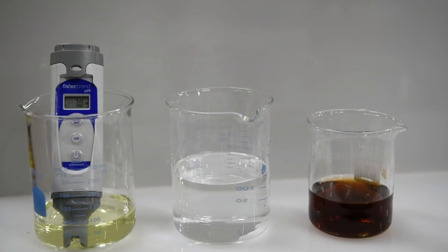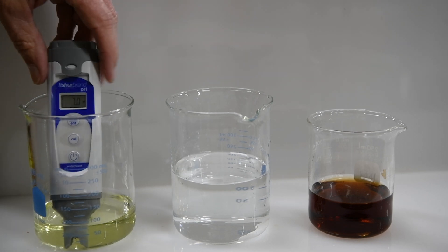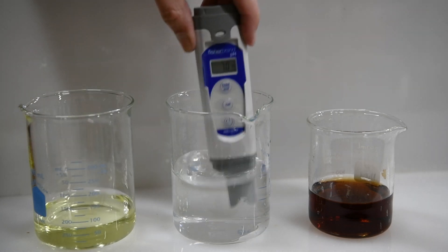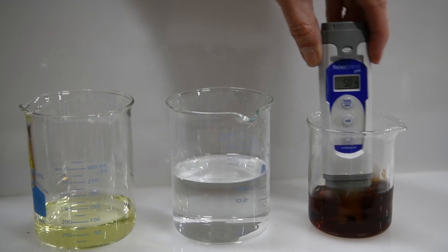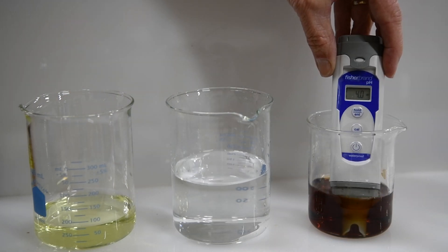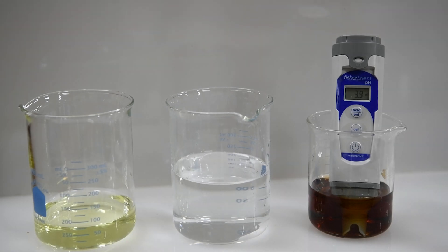Next, we'll test the sample of Diet Coke for comparison. So once again, we'll rinse off our pH meter, put it in the beaker of Diet Coke, give it a moment to steady. And it looks like we have a pH of about 3.9.